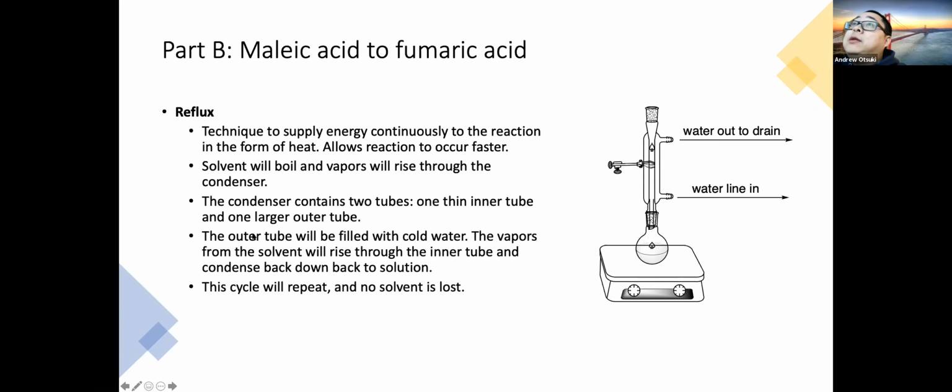So there's not much you have to kind of know about reflux. You're just going to watch the video and see how it's done. But this is generally how it works. And this is a clamp. You would clamp this to a stand or something so it's stable. Okay. And usually in this solution, you'll add a stir bar to maintain stirring, because I think you add boiling chips in the experiment. So you need boiling chips or a stirrer to maintain very smooth evaporation or reflux conditions.